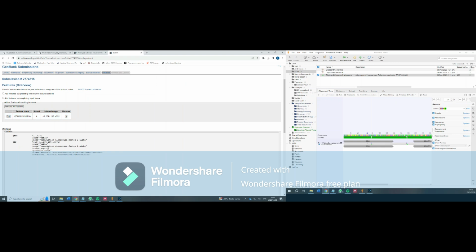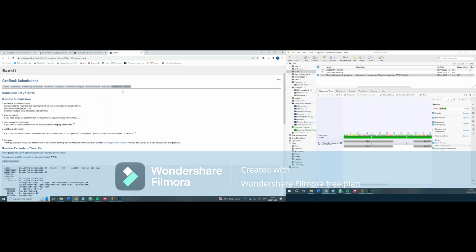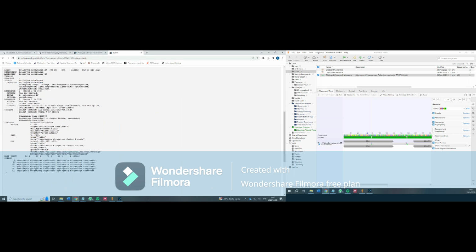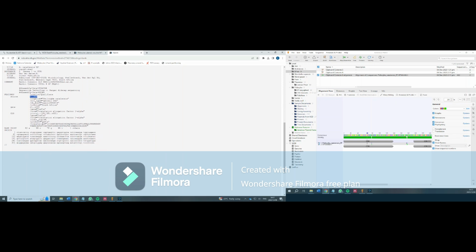And finish submission. Geneious Prime, I think you can have a 30-day free trial if you want to use it. Unfortunately it is a paid app, but there are other free options out there, I believe. And that's it. Nothing else much to it. Sweet. Finish submission.